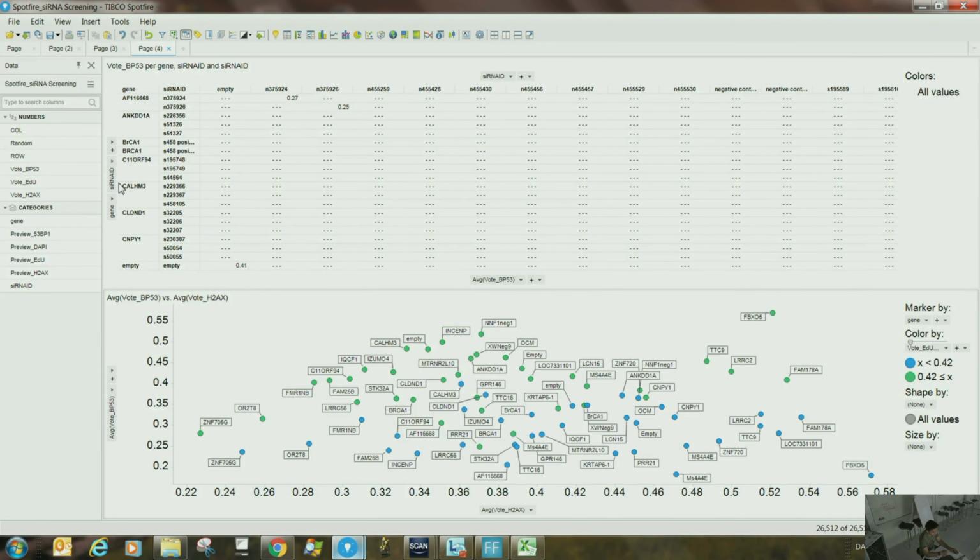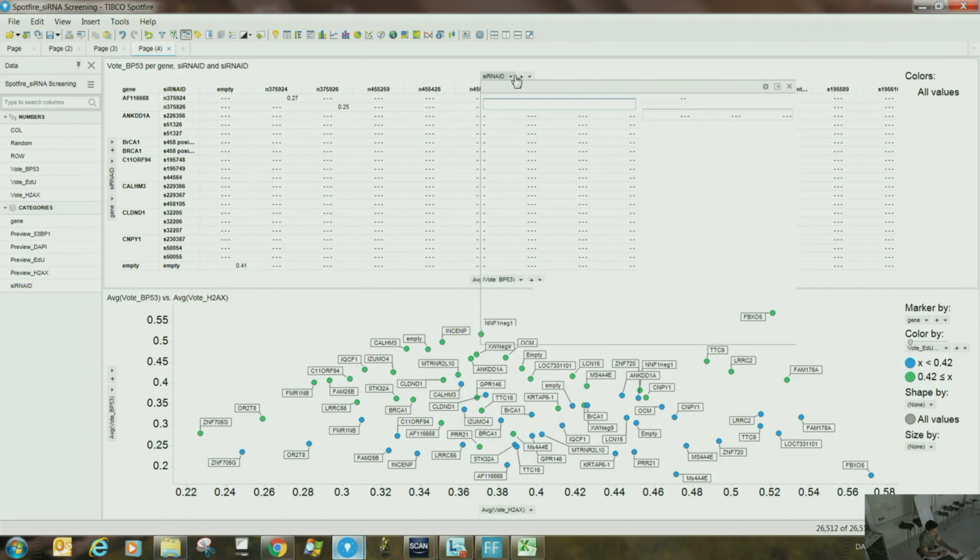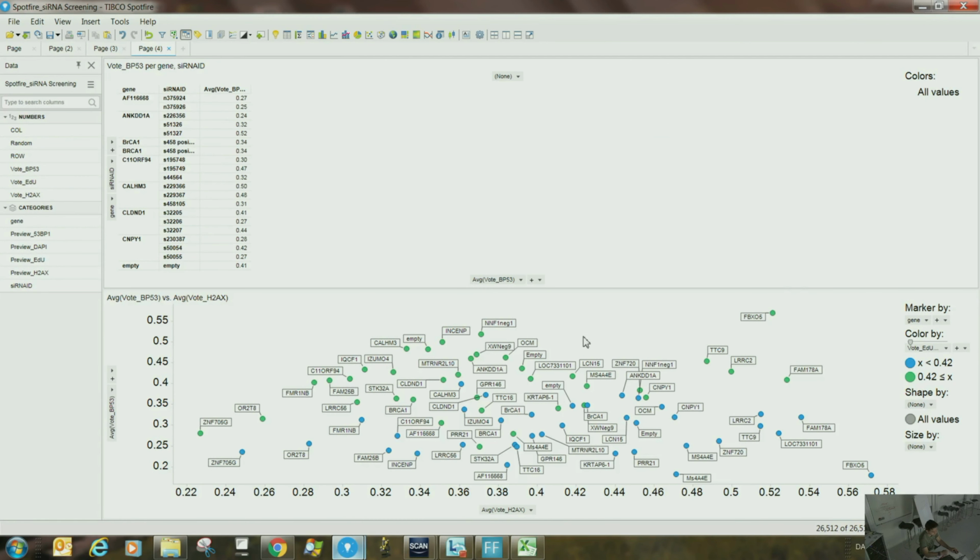for a particular cell. And then here I would say, okay, I'm not interested, I should remove it, right? So you're going to see only the one column. So this is a gene. This gene has 2 siRNAs of that particular name, and every siRNA may have multiple cells, right? And this is the average value of all these cells, which is basically this one, right? And with this I can actually sort it.